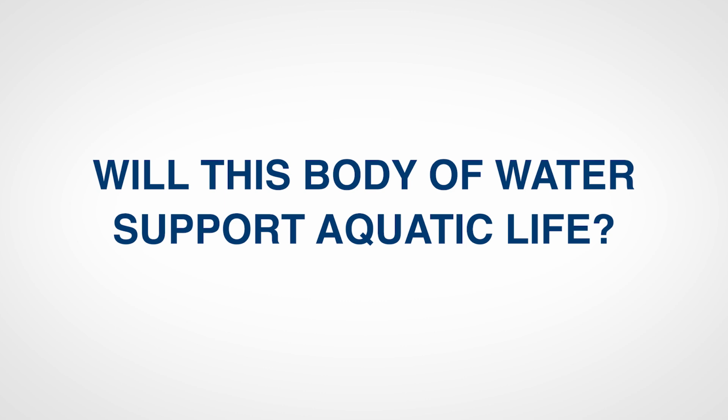In this segment, we will analyze and interpret our results. We'll start with recording the dissolved oxygen on our data sheet. What you need to decide is if the results from our dissolved oxygen test today would support aquatic life in your water. Aquatic life need at least 3 parts per million to be considered within a healthy normal range.